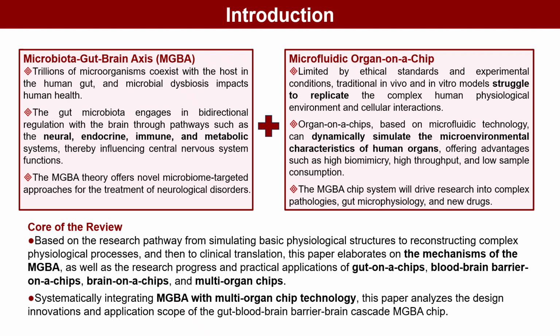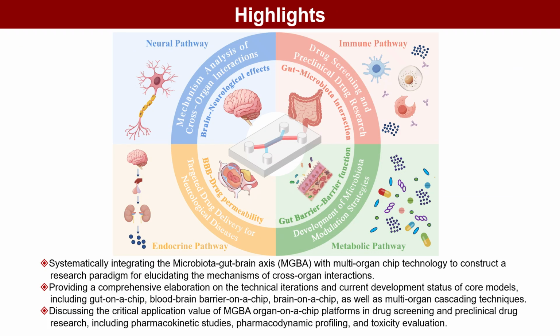Microfluidic organ-on-a-chip technology dynamically mimics the microscale physiological environment of human organs, offering a platform for complex disease study and drug development. The highlight of this review lies in the systematic integration of the MGBA and multi-organ chip technology, and the comprehensive exposition of the development status and application significance of each module unit in the system in the form of technological iteration, demonstrating the key application value of MGBA multi-organ chips in disease research and new drug development.